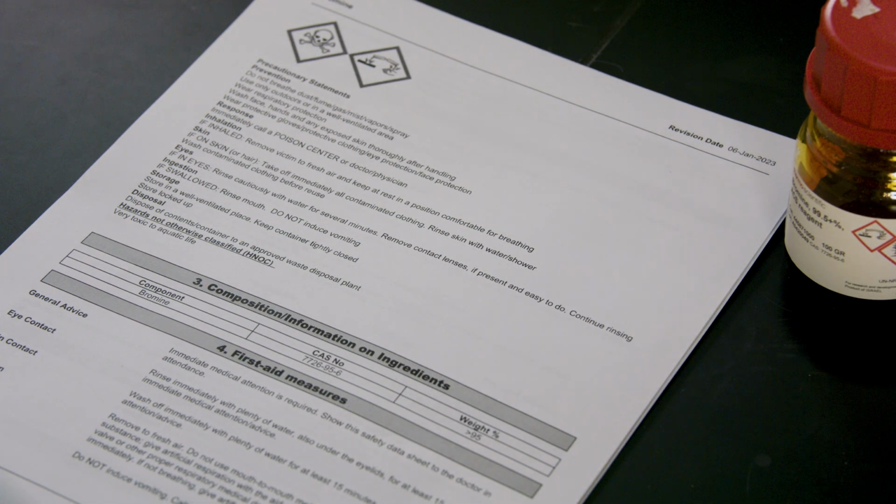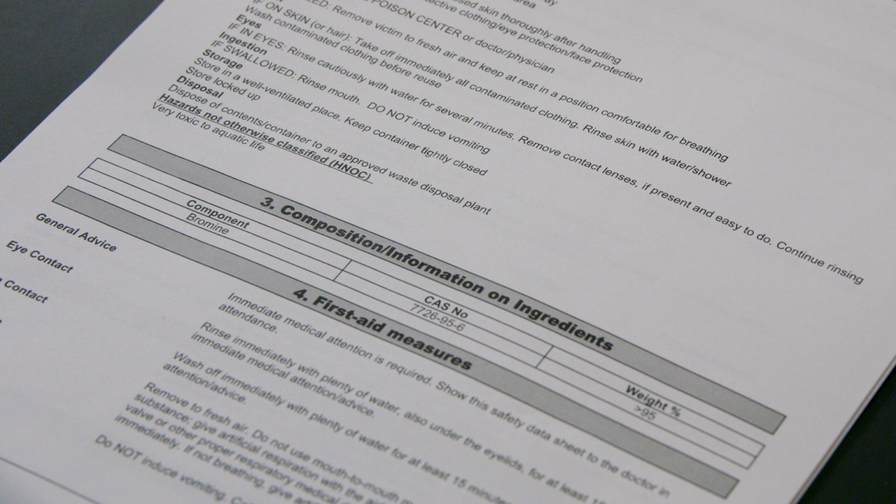Section 4, First Aid Measures, is important for emergencies. Here, you'll learn what to do in case of exposure to the chemical. It provides step-by-step instructions on how to respond to different types of exposure, like skin contact or inhalation.